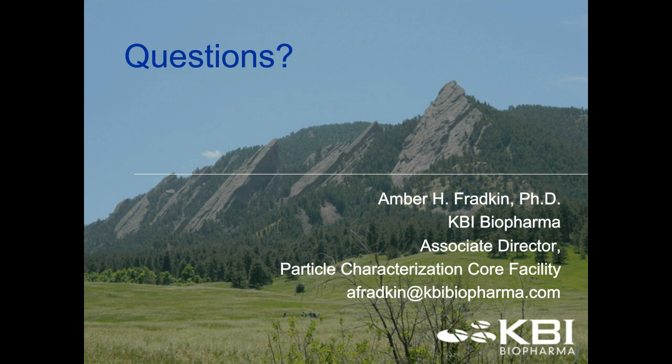So Archimedes, as I mentioned, is a buoyancy-based technique. Obviously, the limitations there are that the capillary is only 6 micron in diameter, so we can't get different buoyancies for particles larger than 6 micron with this technique. So we are able to characterize positively buoyant and negatively buoyant particles. If we don't assume densities, we can certainly have that instrument output the different masses or buoyant densities of particles flowing through that system.